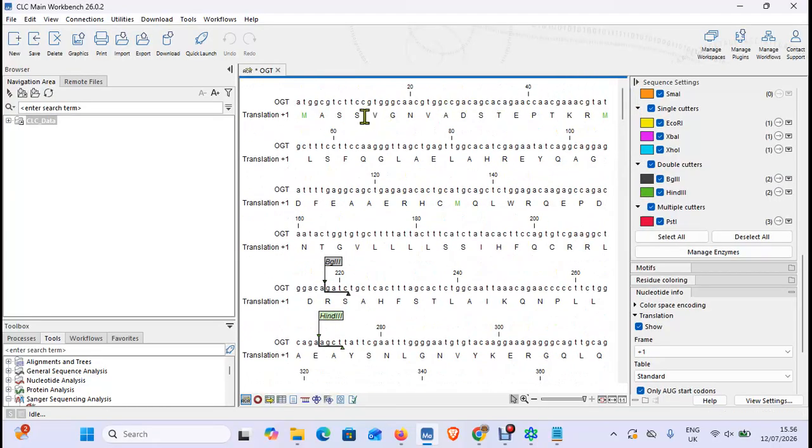So yes, you'll see me repeat the counting exercise, but for less trustworthy templates like RNA, cDNA libraries, anything that you're not 100% sure about, you really want to stack the deck. 78 is your operational floor, following my trusty rules. So we got 12, we got 20, we got 30, 42, 50, 60, 70, 76, hey, 80 is A-OK as well.